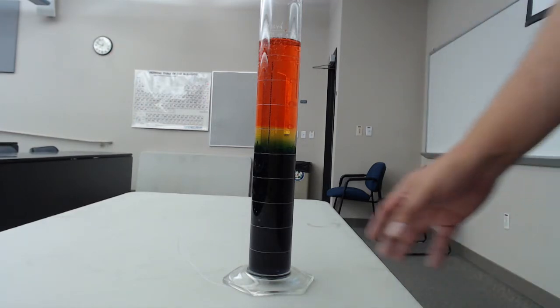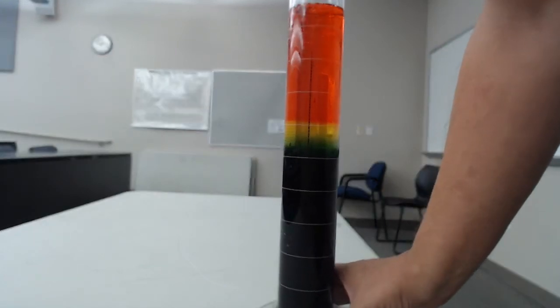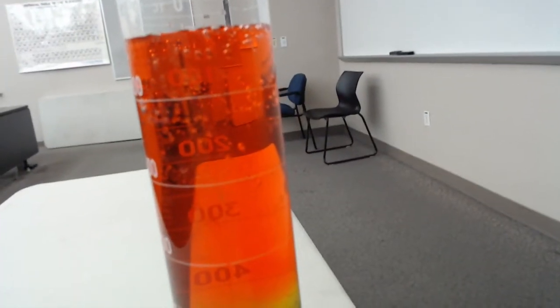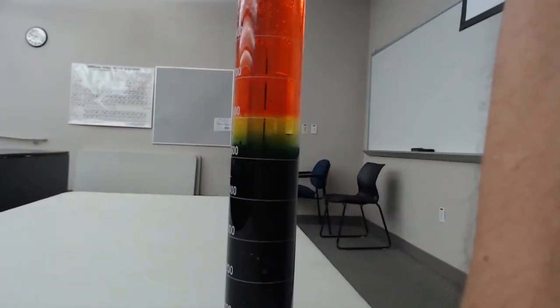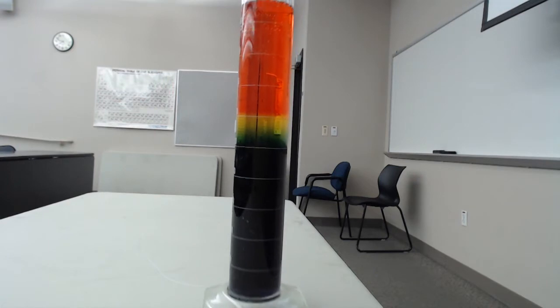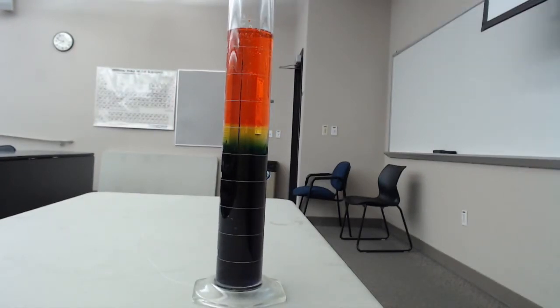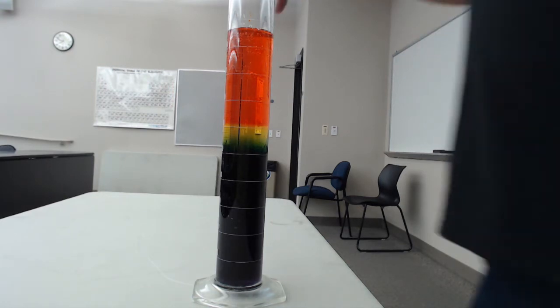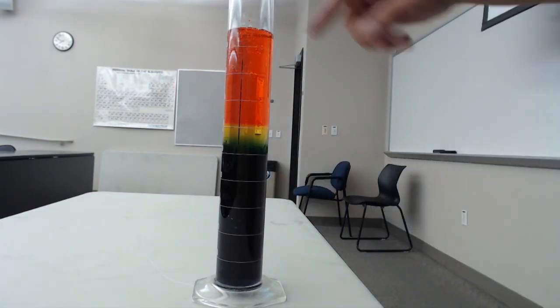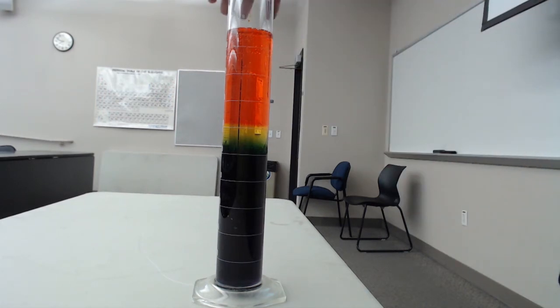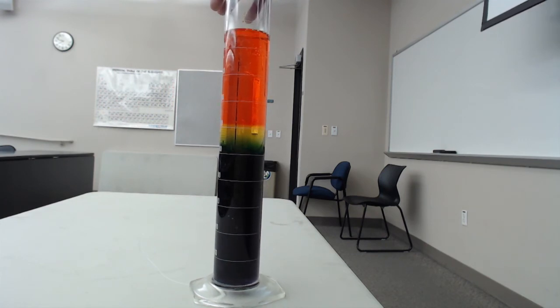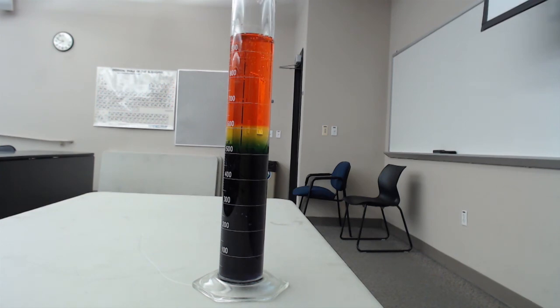I'm saying here that the base was saturated sodium carbonate. Does anybody by chance know what the little bubbles that are forming right here are? It's actually carbon dioxide. When you have carbonates, CO3 2-, and you treat them with acid, they quickly become carbon dioxide gas. That's actually why one of the examples of carbonate you have in your homes is baking soda, bicarbonate, that reacts with vinegar, an acid, and you get that bubbling - that's carbon dioxide. It turns out that carbonate rather than bicarbonate bubbles a little bit less because we need two moles of hydrogen per one mole of carbonate. You basically need more acid to get it to turn. Pretty cool, one of the classic demos there.